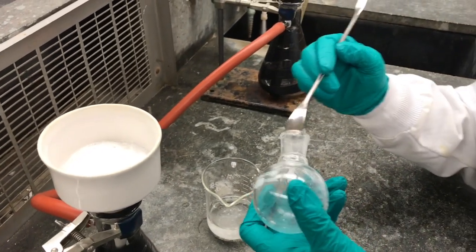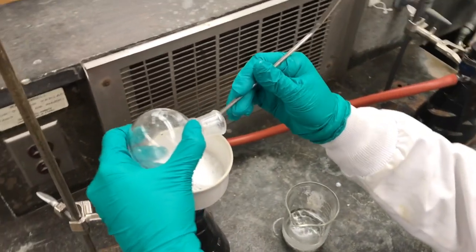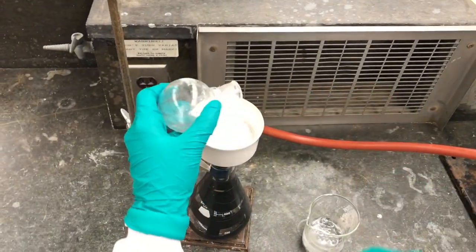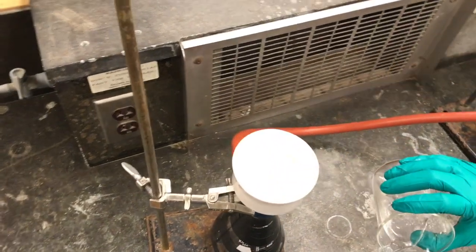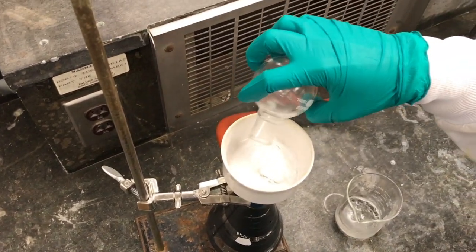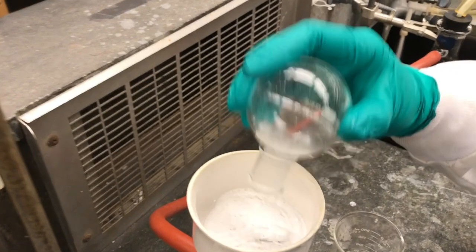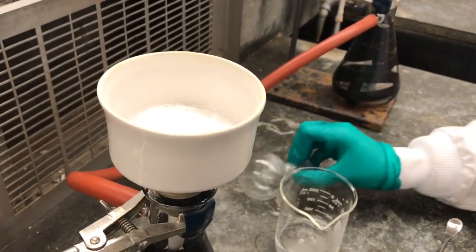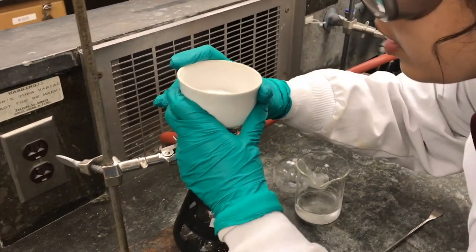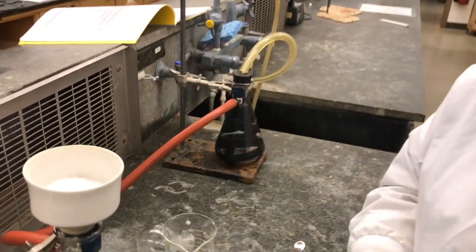Maybe scrape the sides a little bit if you want to transfer all of it, and press it gently down to ensure maximum vacuum. And we're just going to wait till it gets dried, and we'll be back soon.